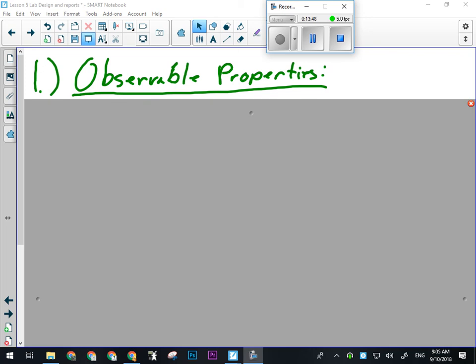Like if we're talking about a solubility test, for example, we said that part of the solubility test is also checking to see if there's any temperature change when the water is added. So when you're explaining how to do the solubility test, you don't write "perform solubility test." That's not very specific. Somebody's not really going to know what to do there. So you would say, with the thermometer in the unknown sample, record the initial temperature. Then add water slowly until the depression is full, recording the temperature while this is going on and gently agitating.